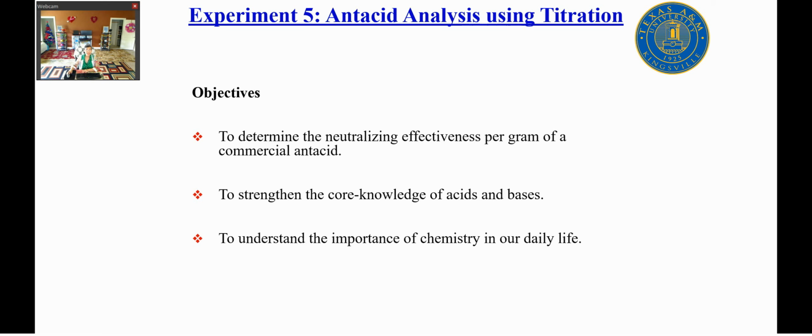We are going to discuss your experiment number 5, antacid analysis using titration. Objectives of this lab: to determine the neutralizing effectiveness per gram of a commercial antacid, to strengthen the core knowledge on mastering acids and bases, to understand the importance of chemistry in our daily life.